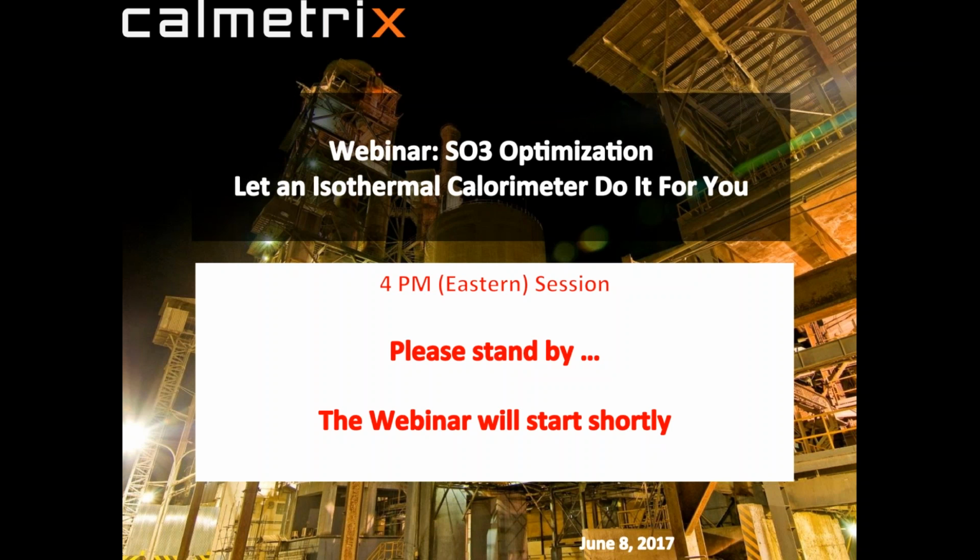So good afternoon, everybody. Thanks for participating. This afternoon, it's a presentation about sulfate optimization. And sulfate optimization is a topic that's dear to every cement producer's heart, but it's also something that comes up and is very important when you develop new additives or when you work on new SCMs or existing SCMs and try to understand the kinetics of how things work, how different materials interact, because in effect it's one of the components that gets drawn upon by other materials that you use besides cement.